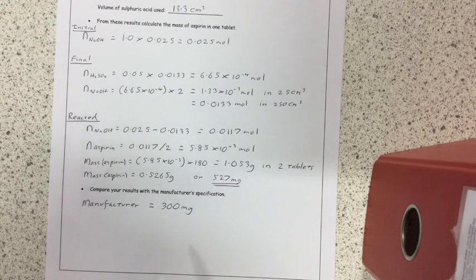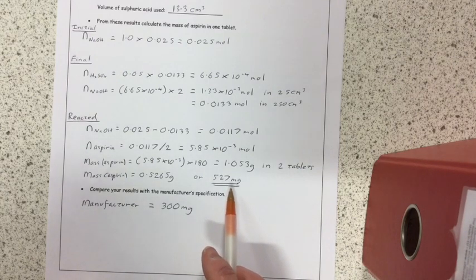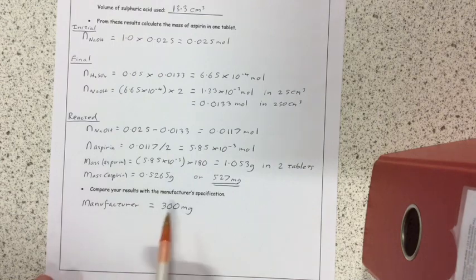Another possible reason, of course, is that the sodium hydroxide was reacting with other things in the tablet other than aspirin, because if only 300 milligrams of the tablet is aspirin, you know, you've got about another 300 milligrams of other materials, and some of them may have reacted to the sodium hydroxide. So, not all the sodium hydroxide reacting necessarily reacted with aspirin. So, you should just take a couple of notes down here of possible explanations to account for the difference, if there is a big difference in your results, between your calculated value and the manufacturer's value.